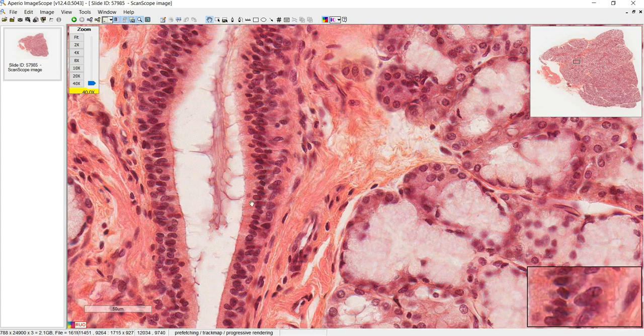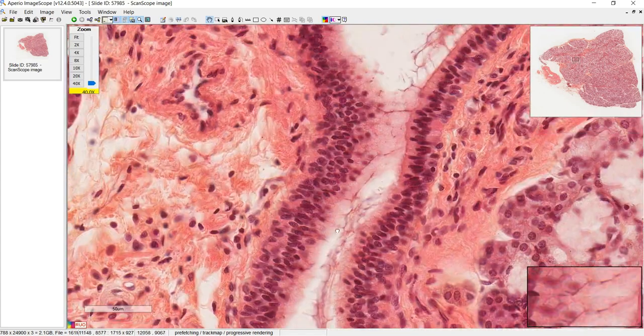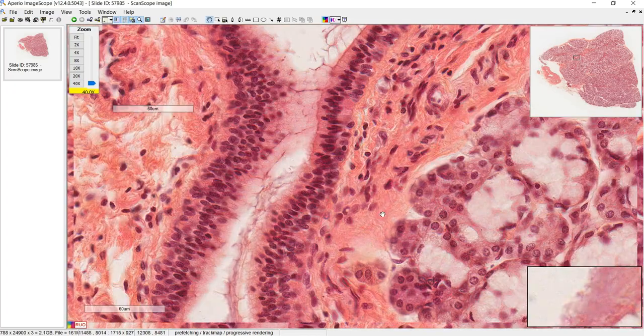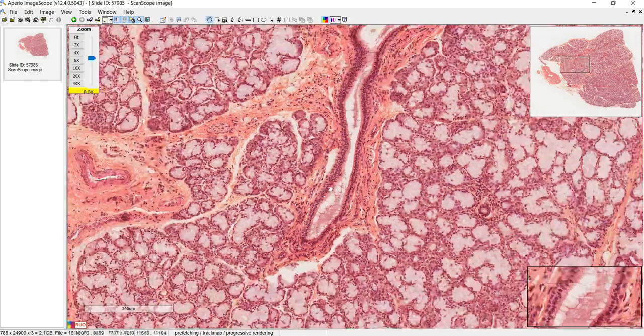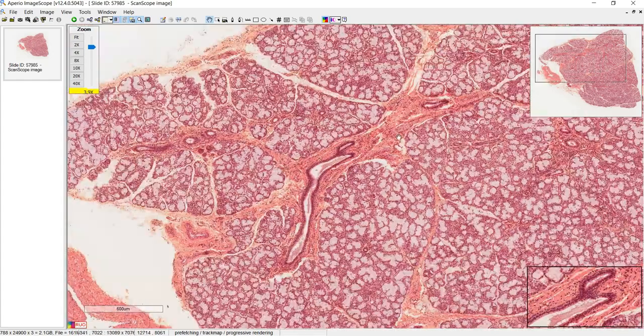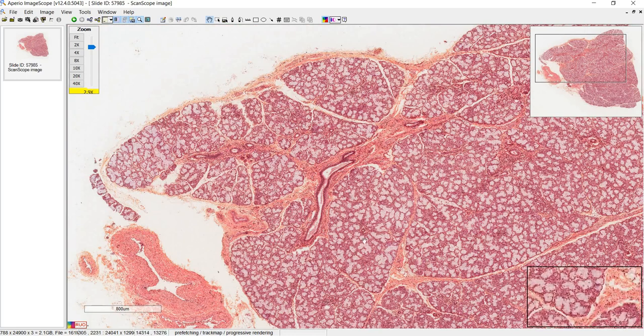Yeah, so you want to double check the epithelium, make sure it's a columnar. Yeah. So I'd be happy pointing this one out as an interlobular duct or an excretory duct. I don't think they're going to make a big deal about the difference between the two. And that concludes our module on the salivary glands.